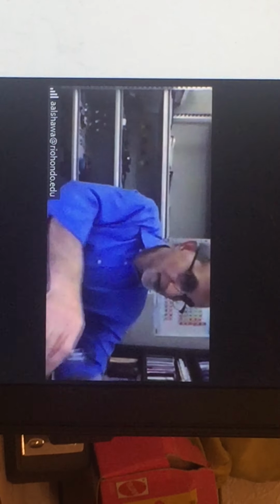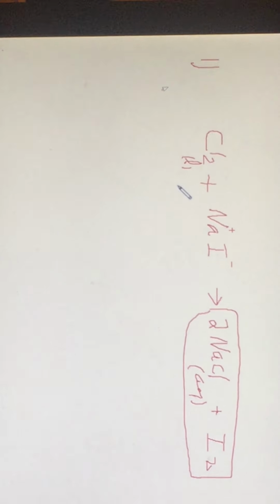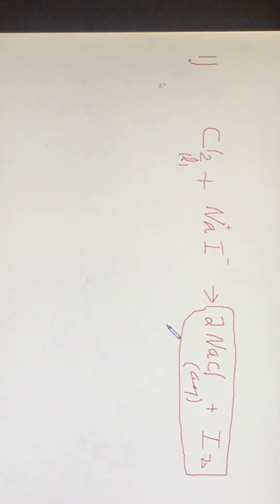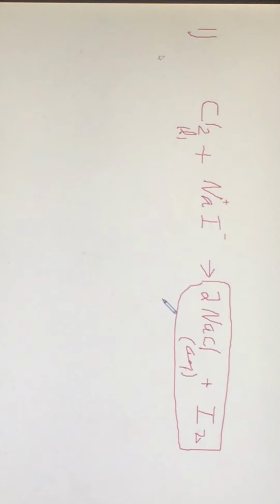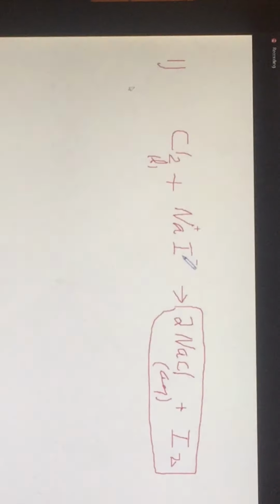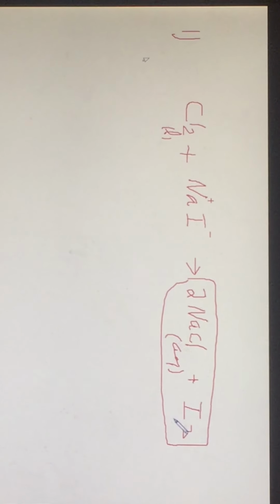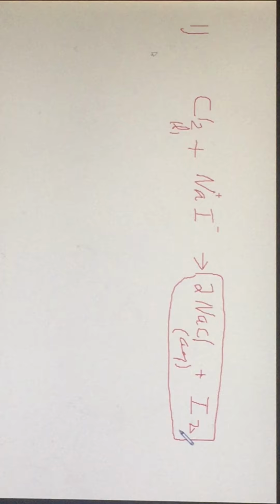Makes sense? So you can readily tell them apart quickly, whether you have iodide or bromide. If you have bromide in the solution and add the chlorine water, the outcome is an orangey, rusty color. If your unknown turns out to have an iodide, and there's a reaction when you add the chlorine to it, what must the color be in the organic layer? Pink color.